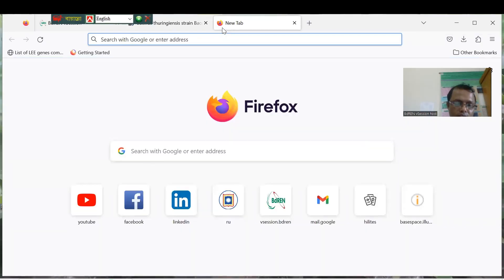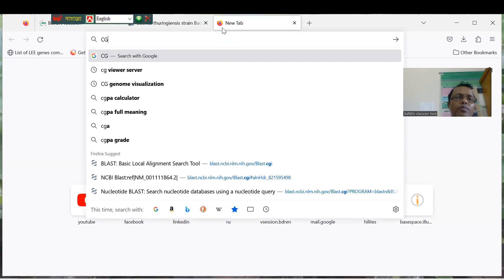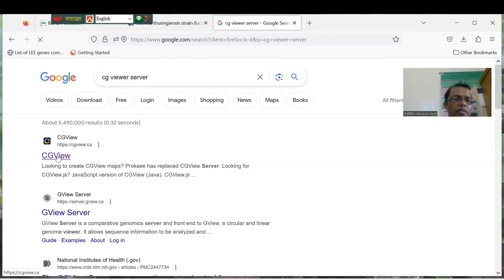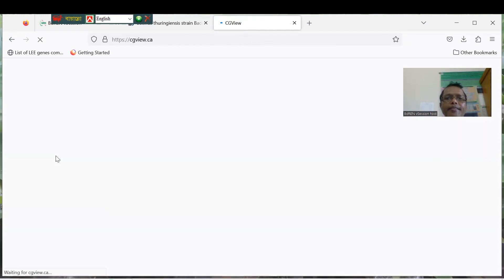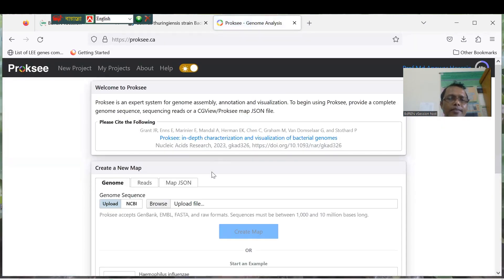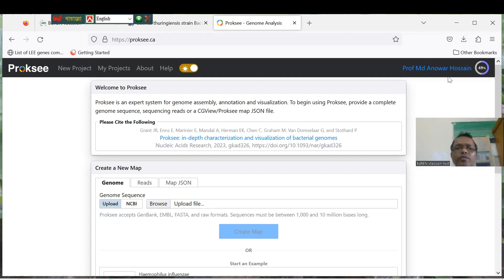Now we are looking for CGViewer. You can see the CGViewer server here. Click on CGViewer — there are three websites listed. We can use the option to create CGViewer maps. Click the Proksee server. You can see that I am already logged in. If you don't have an account, please open an account and sign up, then log in.